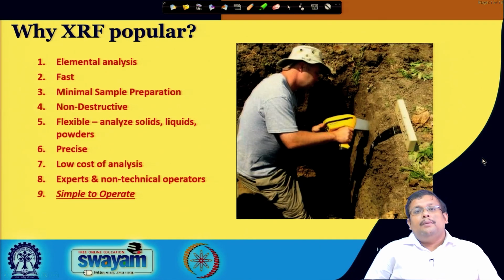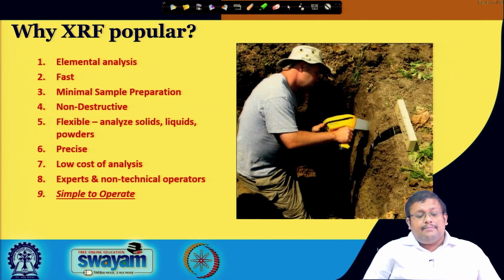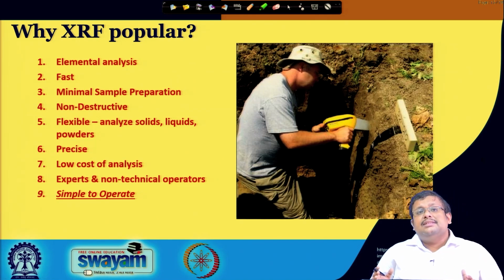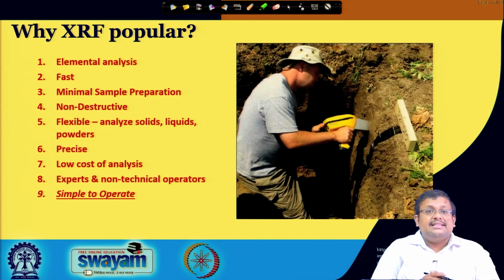So, why is XRF so popular? There are several reasons. First of all, it helps us with elemental analysis. It is fast, the handheld XRF can give you the results of total elemental concentration in only 60 to 90 seconds. It requires minimum sample preparation.